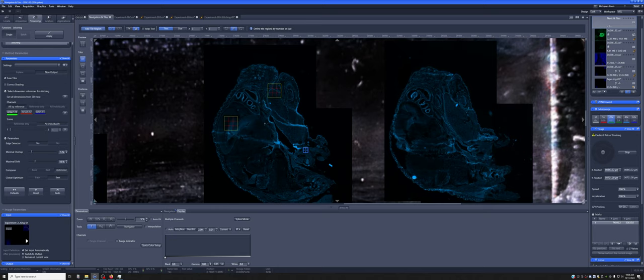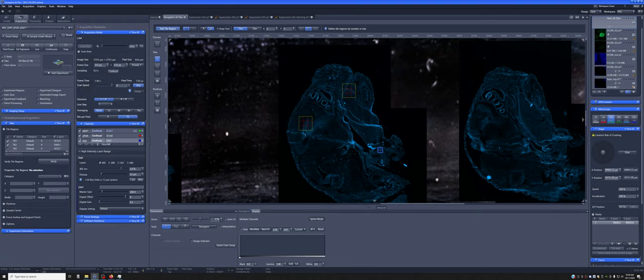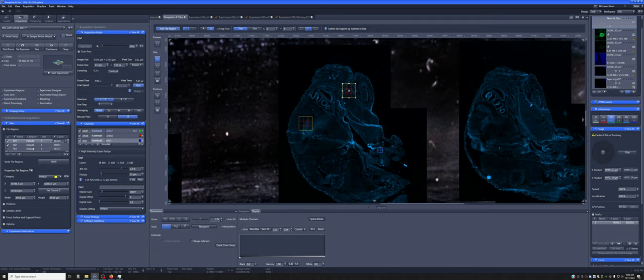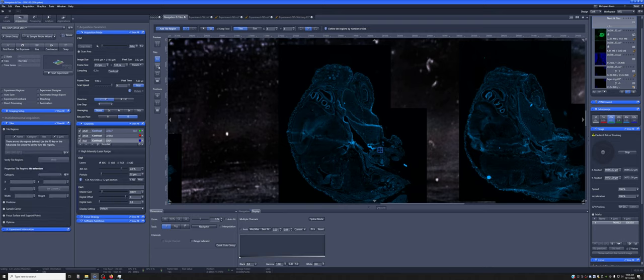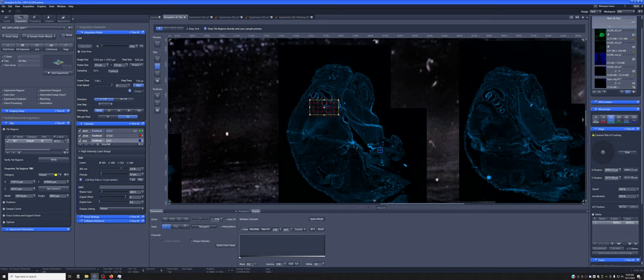But you may not want to do a certain either square or rectangular tile that you have to estimate by hand. You may want instead to draw where you want to image. And so you can do that. I'm going to delete all of these using this other tiles tool. In this case, you can just draw where you want to take a tile.